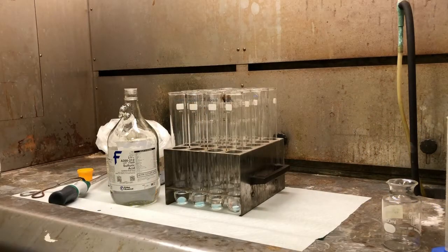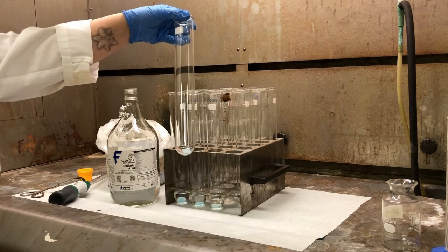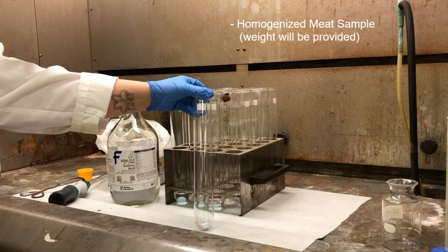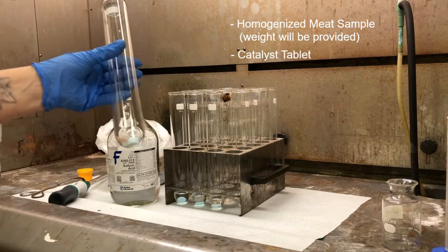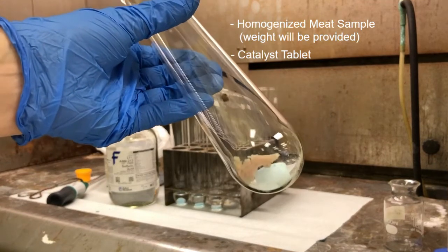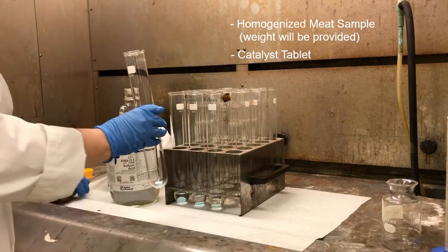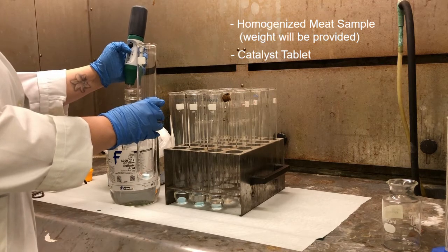Now we're ready to start digesting our samples. We have in the tube about 300 milligrams of the ham sample in this case. I also have in there a Kjeldahl tablet, which is a catalyst tablet. If you look closely, you'll see a little tablet in there. And that just helps the reaction proceed. Then to that, I'm going to add 20 milliliters of sulfuric acid.